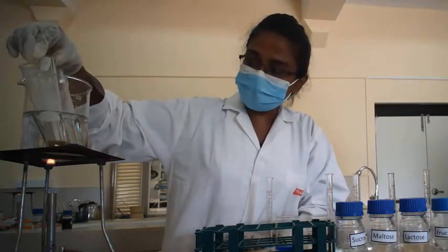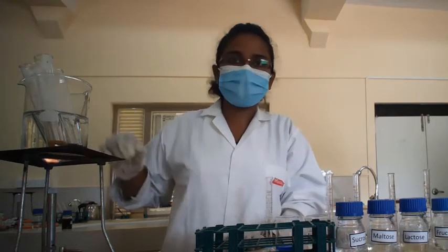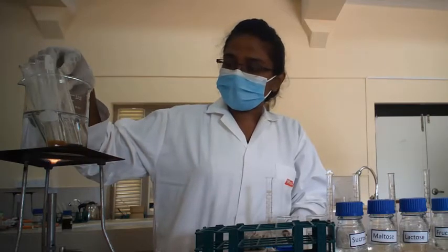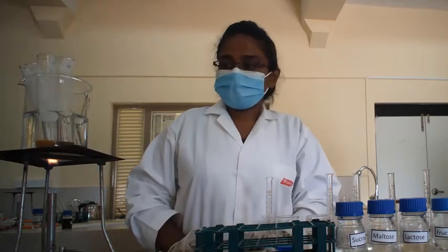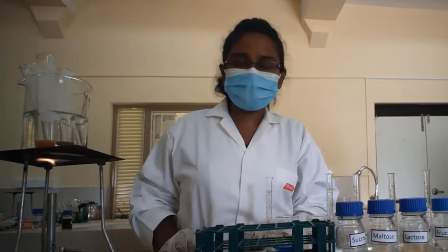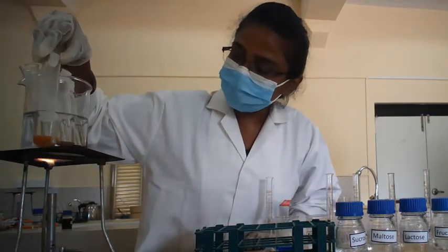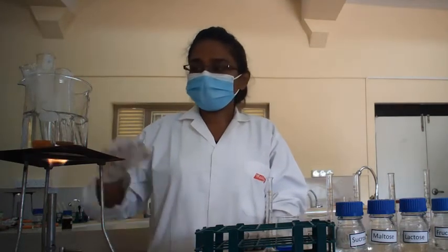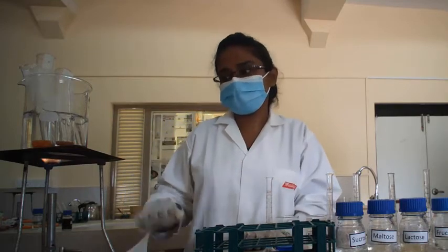As you can see, fructose has already turned into the orange color, and also glucose. Blue color solutions turn to the mud green color, then orange color, then as you can see, it turns into the brick red color. By using this experiment, we can easily identify reducing and non-reducing sugars.